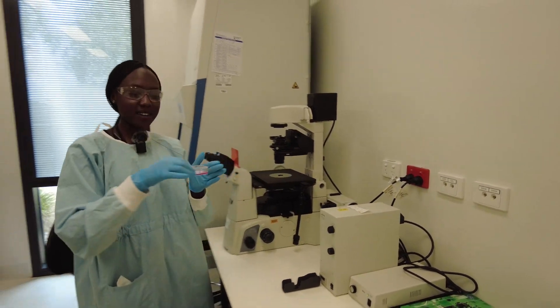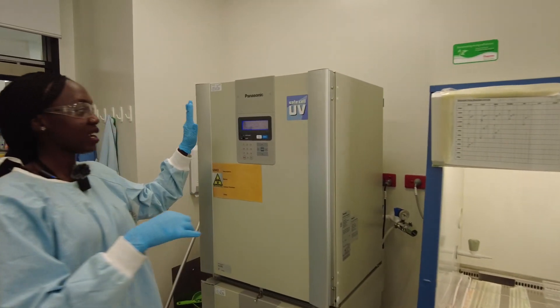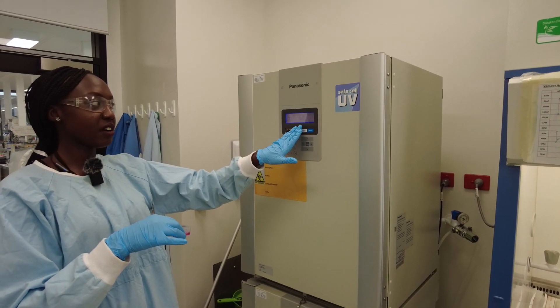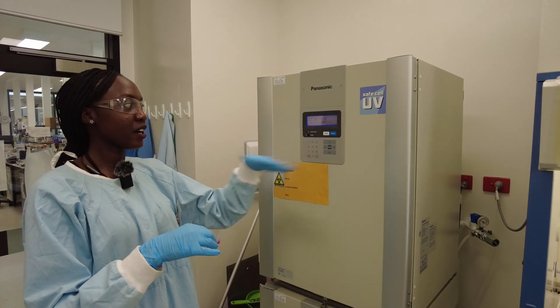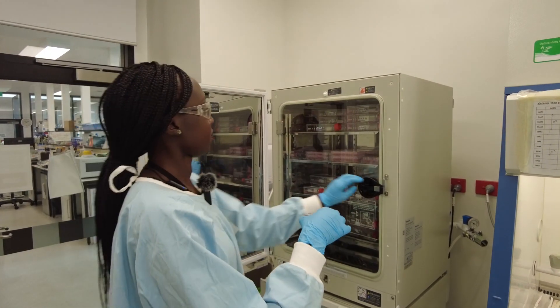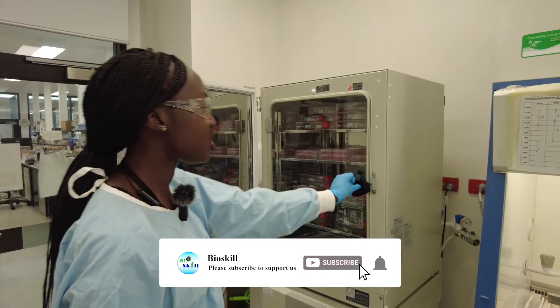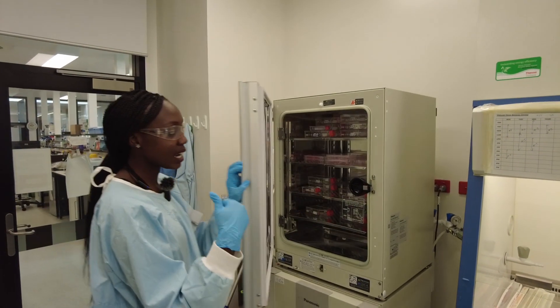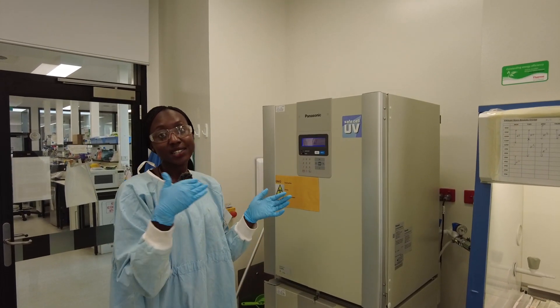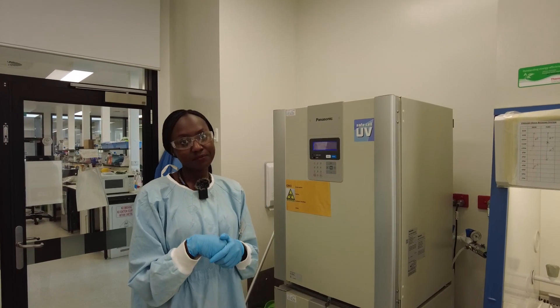Now we're going to put our T25 flask in our Panasonic incubator — it's at 37 degrees with 5% carbon dioxide. This simulates the conditions in the human body, so that's why we put the cells in there. We'll come back and check it tomorrow, then we'll change the media. The media changes color from pink to orange to yellow — as it changes color, that's when we know the pH is changing and we need to add fresh media. That's it.